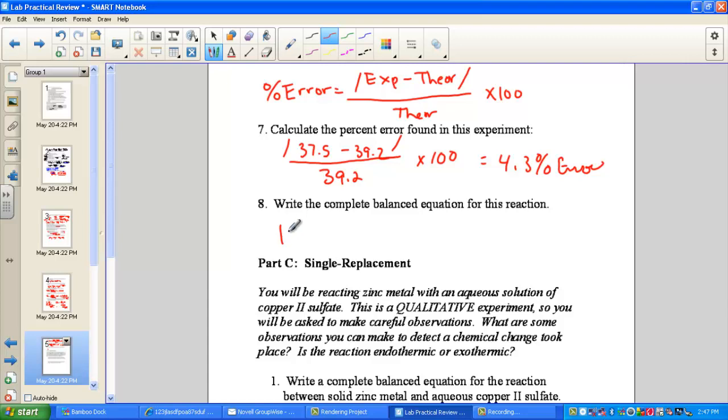The complete balanced equation started with a reactant of potassium chlorate. You will be expected to put those adjectives on. You heated that strongly to force a decomposition, leaving a residue of potassium chloride and releasing molecular oxygen into the air.